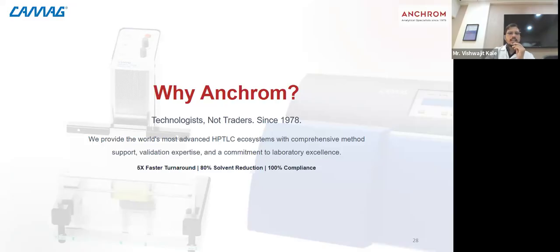Now, with all these slides and the presentation, I wanted to show you some live examples as we did in our laboratory, and I will show you some VisionCAT analysis files where we did actual analysis of phospholipids. I'll open the CAMAG VisionCAT software, that is the HPTLC system control software, and in that I'll show you the analysis for impurity detection done in our laboratory and report generation, and its 21 CFR Part 11 compliance.